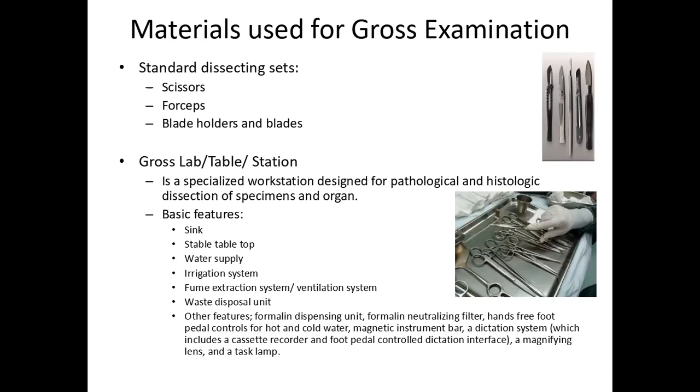So, pwedeng may tatapakan ka, pag tinapakan mo yun, magre-record kung ano yung sinasabi mo. Then after the procedure, you can encode your descriptions. And a magnifying lens as well as a task lamp.